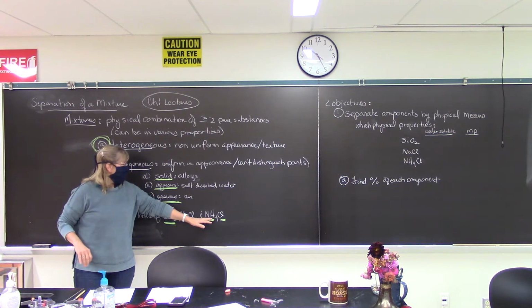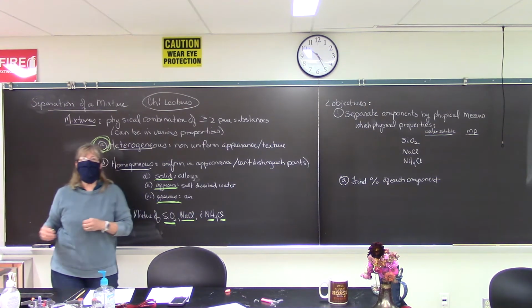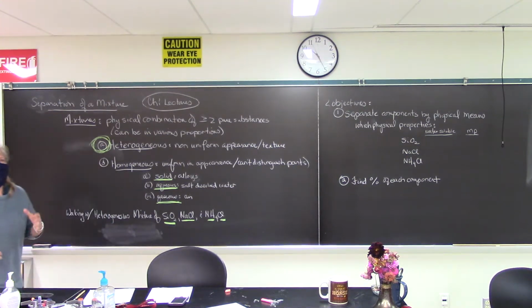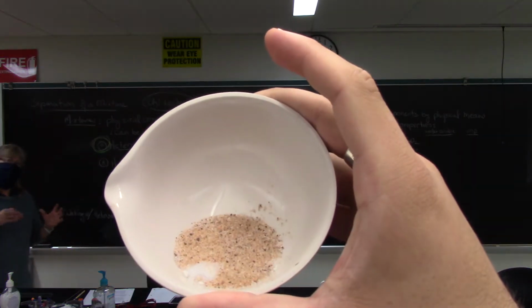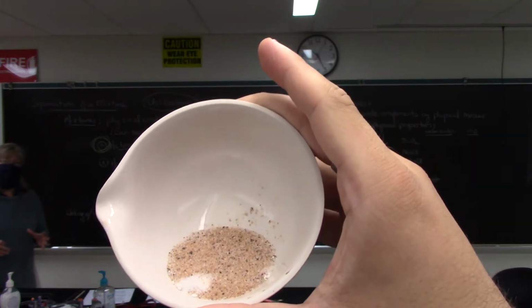Our photographer is going to show you a close-up of the substance, the mixture, and you can see that it's a heterogeneous mixture. You can see the various parts.